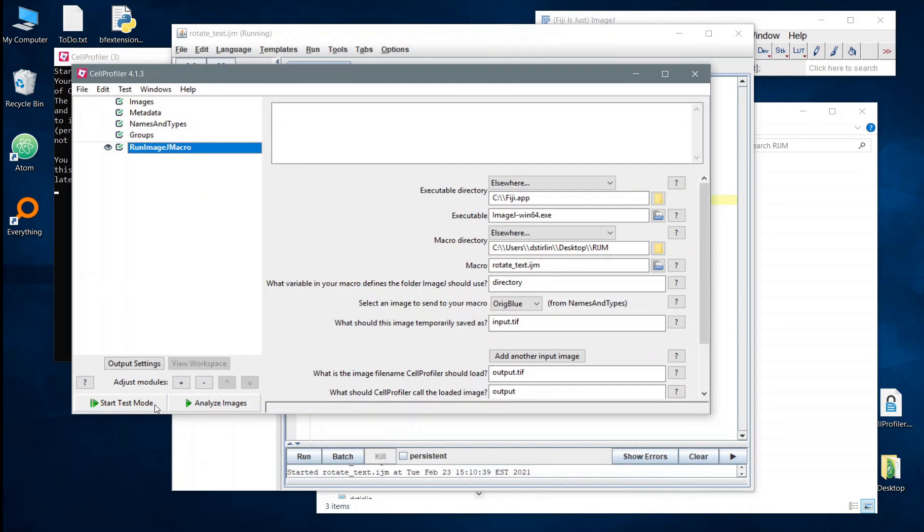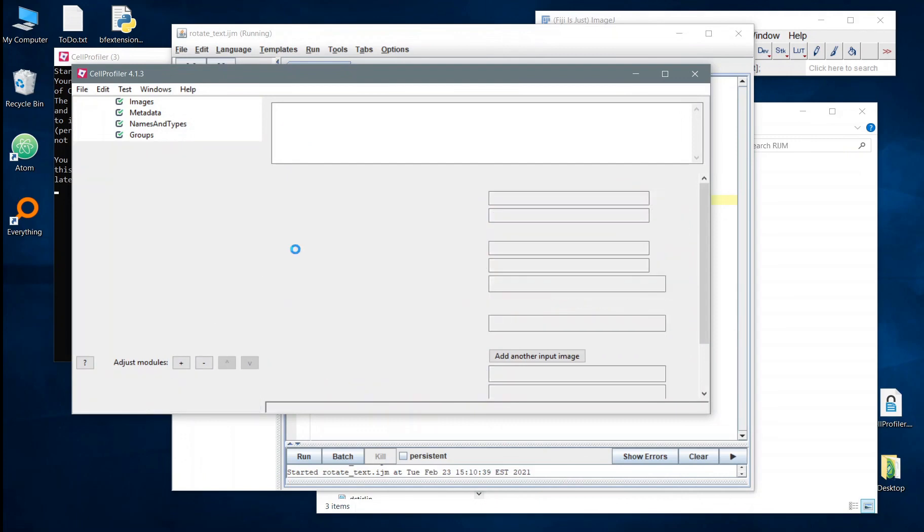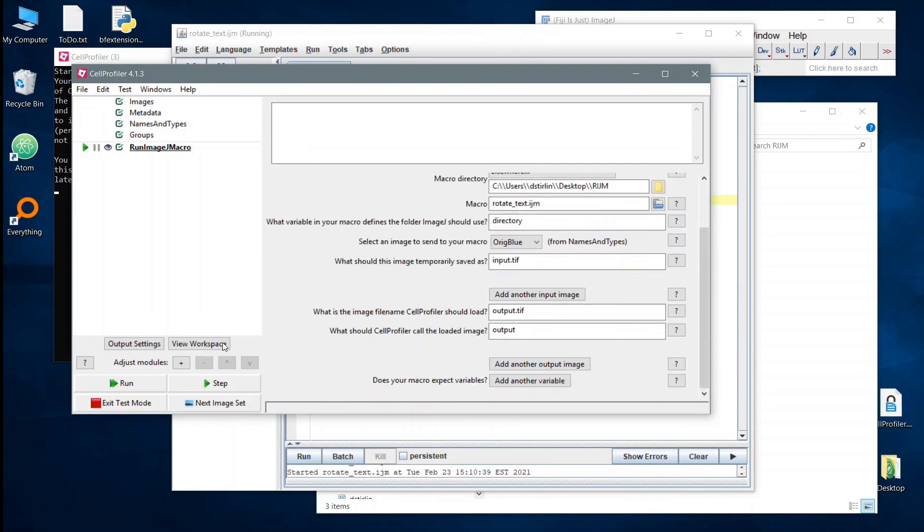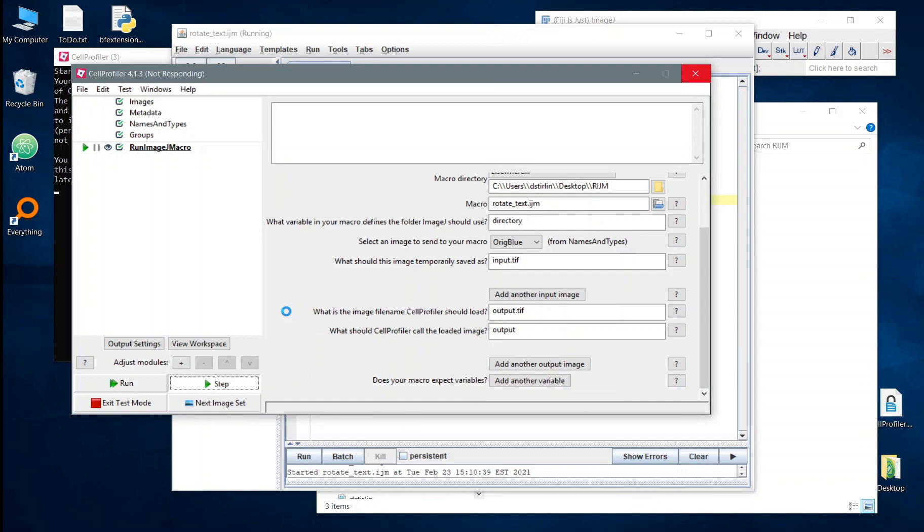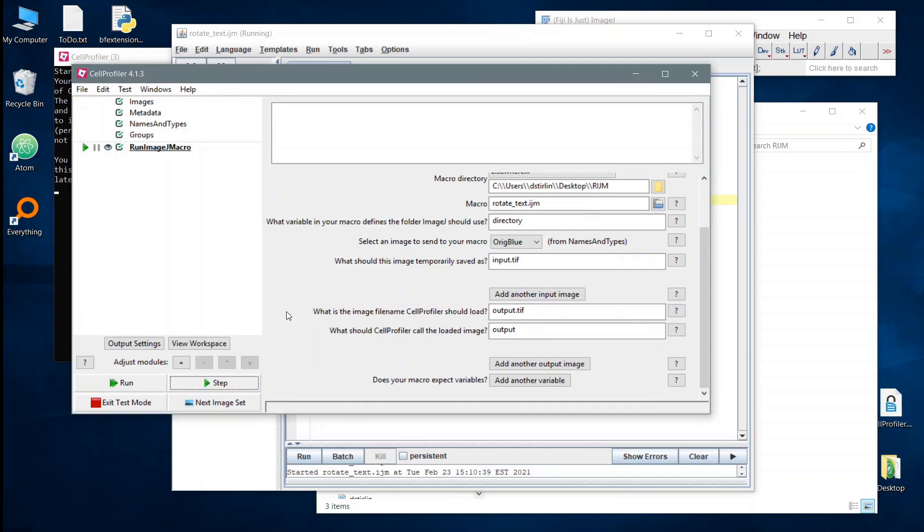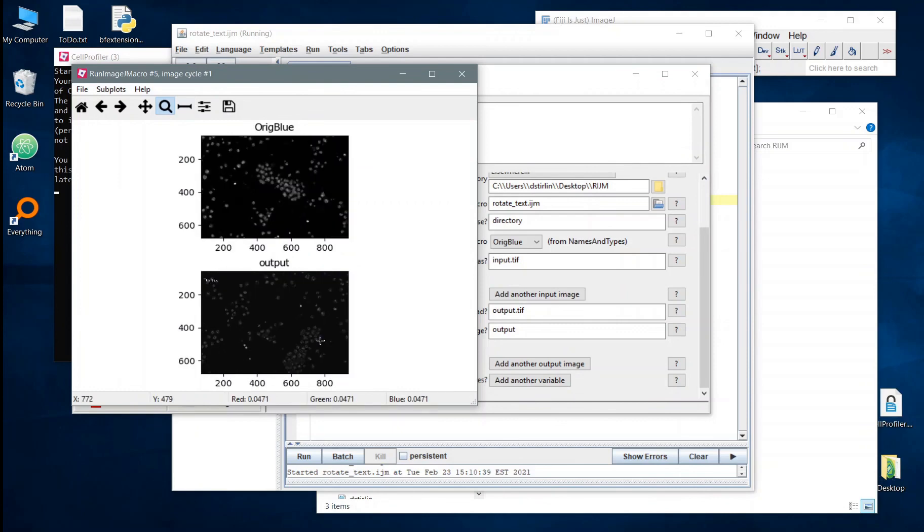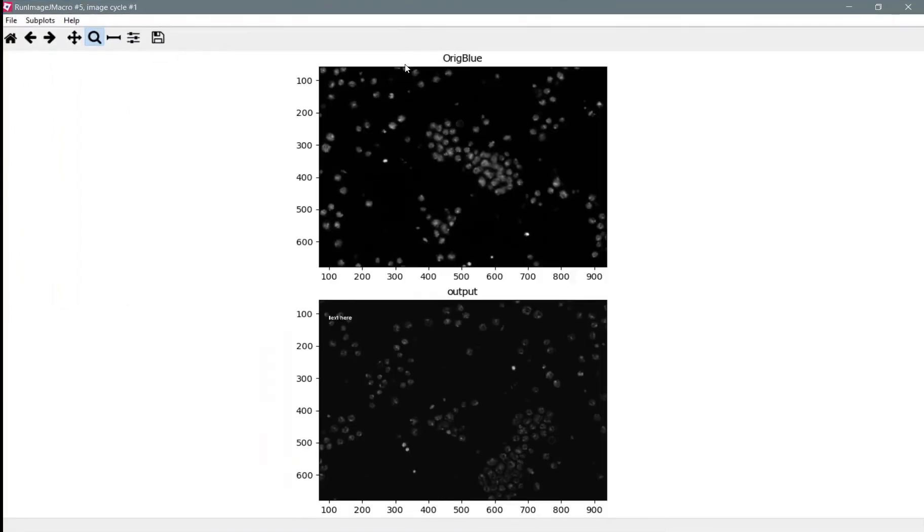However, if we save that and we try running our macro in test mode, hopefully this will give us the result. So you can see the macro successfully pulled in this data that we wanted. We've got our input and the output that came out at the end and you can see we've added this text here.